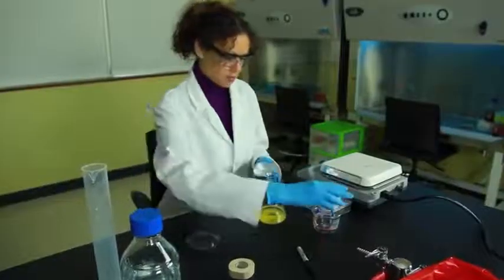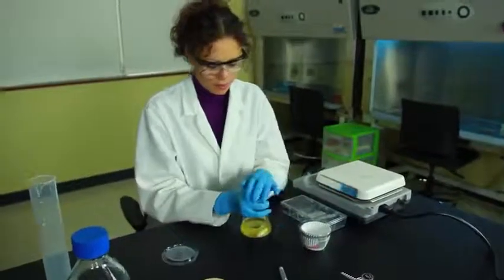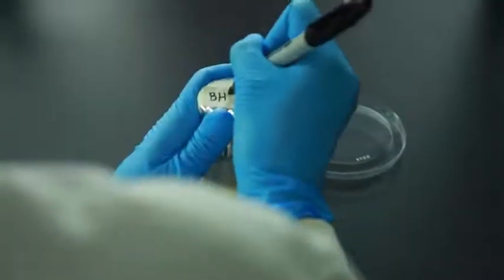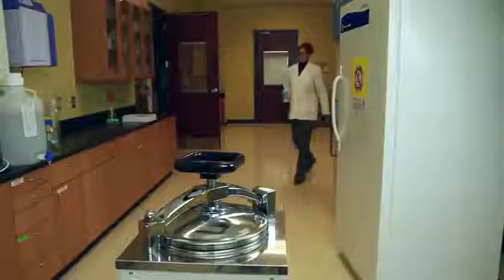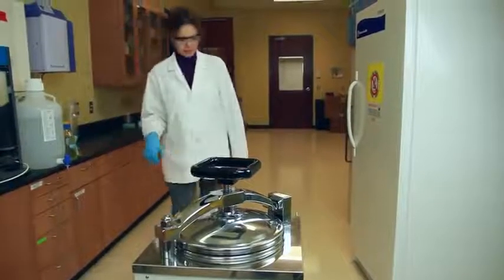Cover the flask with aluminum foil. We're using foil cupcake wrappers because they're the perfect size. Place a piece of autoclave tape over the foil and label it with the media name. Next, use the autoclave to sterilize the media. The heat from the autoclave will also help the agar to properly dissolve in the water.